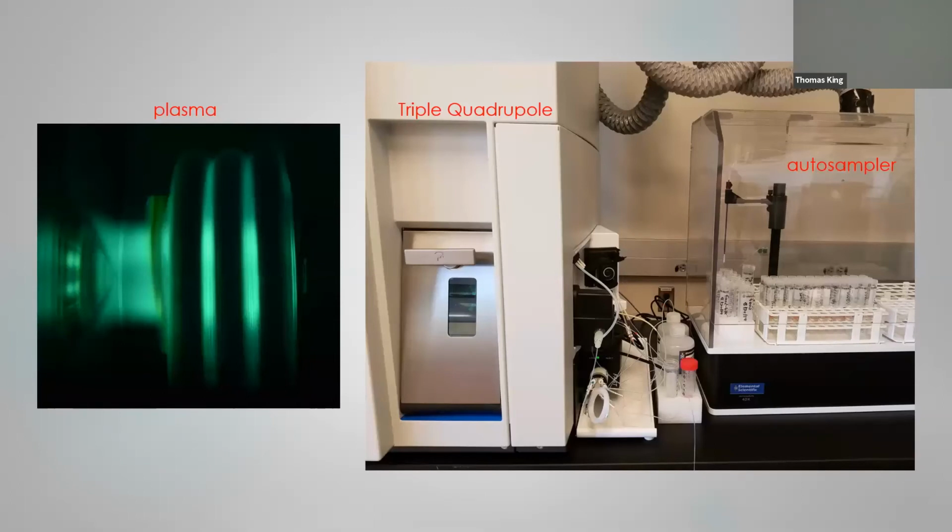And here's a picture of our newer instrument. It is a triple quadrupole ICP-MS. The difference from the single quadrupole is that it's able to remove interferences that the single quadrupole cannot. And here's a picture of the actual plasma that creates the ions that we analyze.